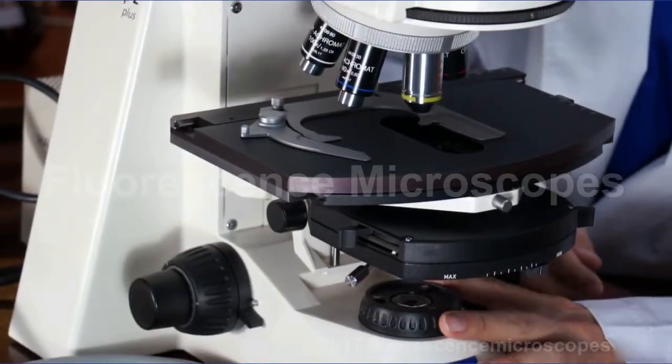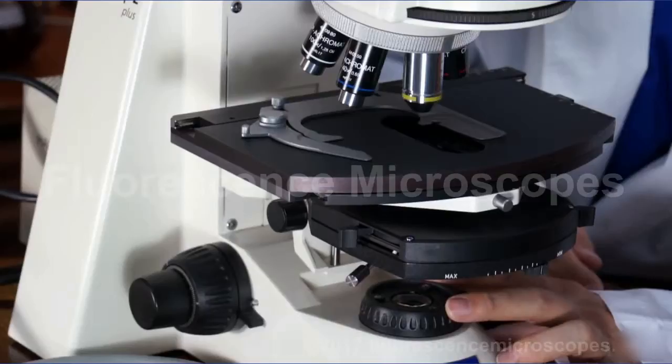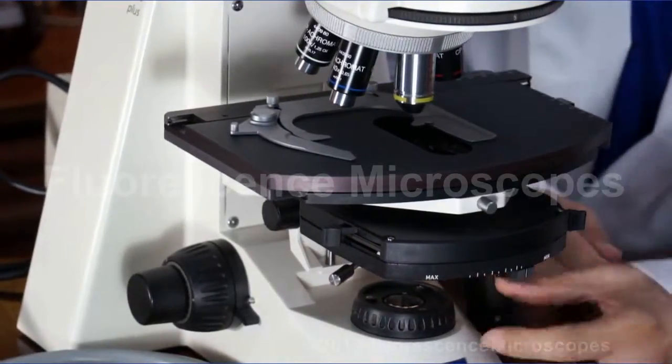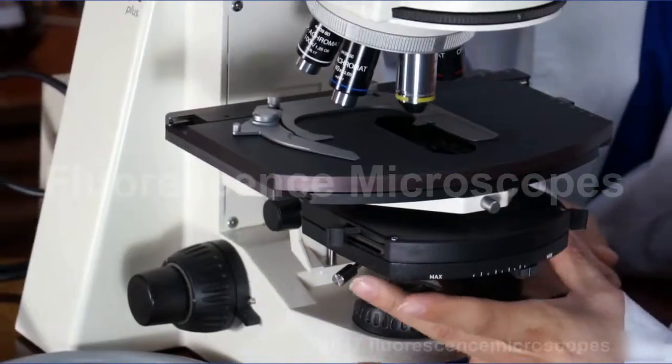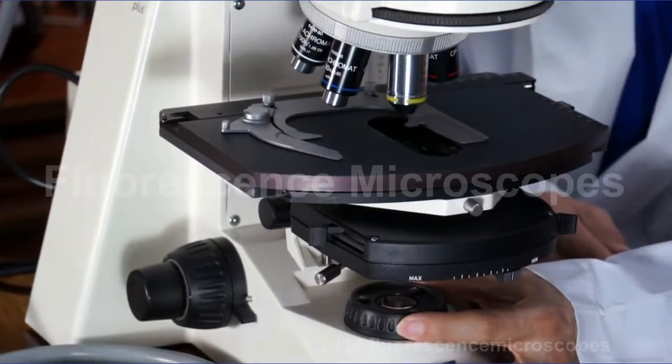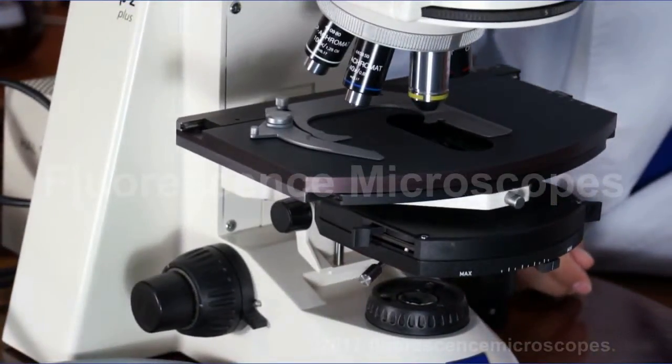The first thing to do on the microscope, or really on any microscope, is to set Kohler illumination. So once you've raised and lowered this so that the field diaphragm is in focus, you center it. Then you open up this aperture, this diaphragm, just past the field of view. Then you've got proper Kohler illumination set.